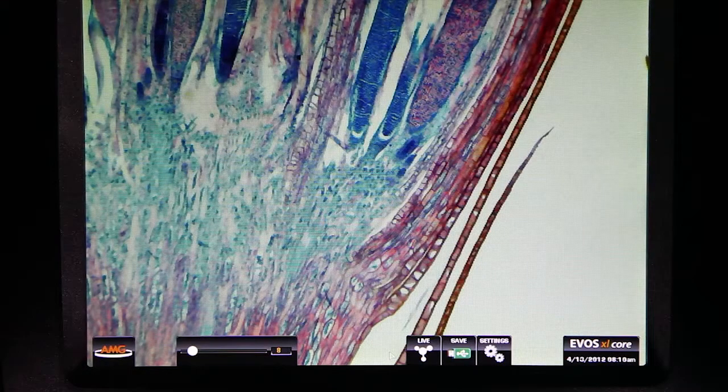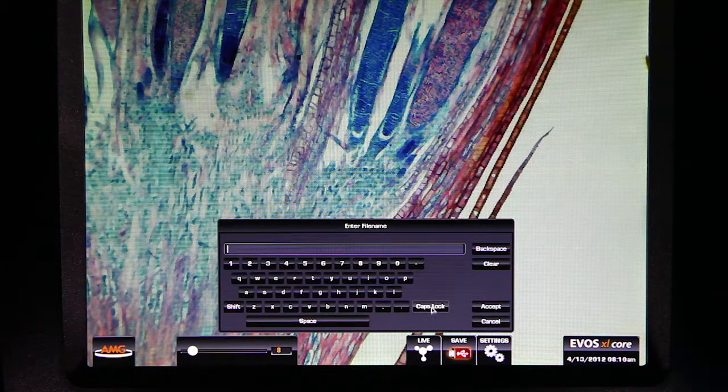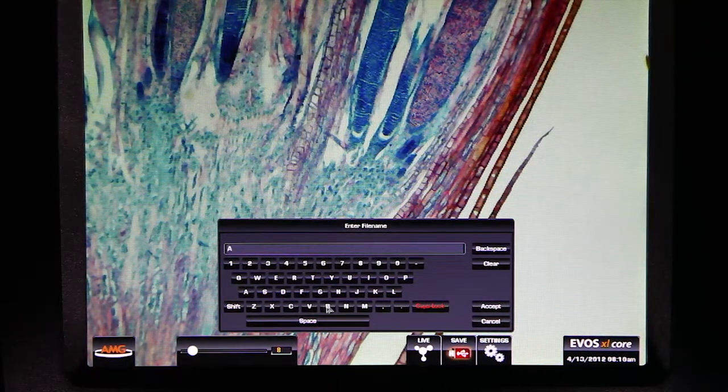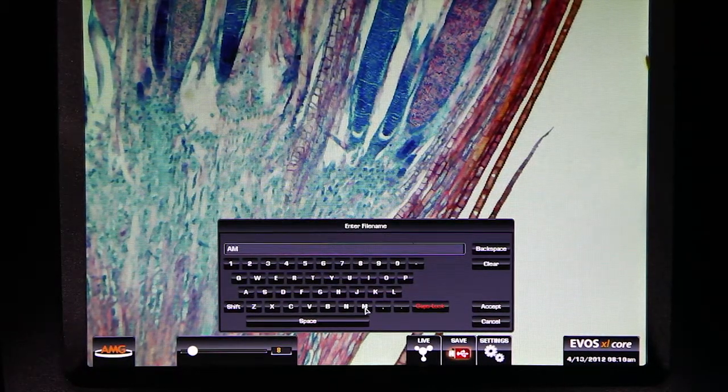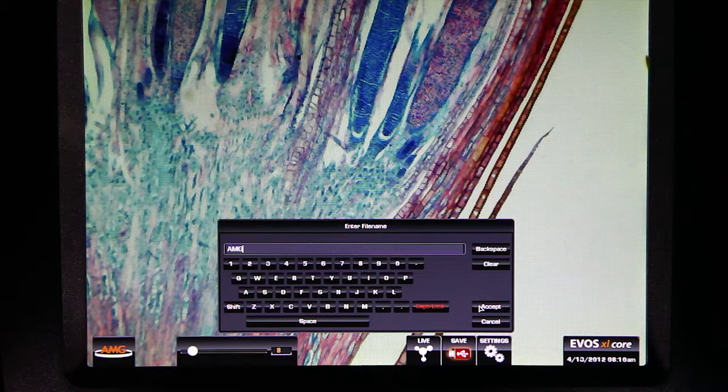To save a captured image, simply select the on-screen save button. This will allow you to name your file and save the image to your flash drive.